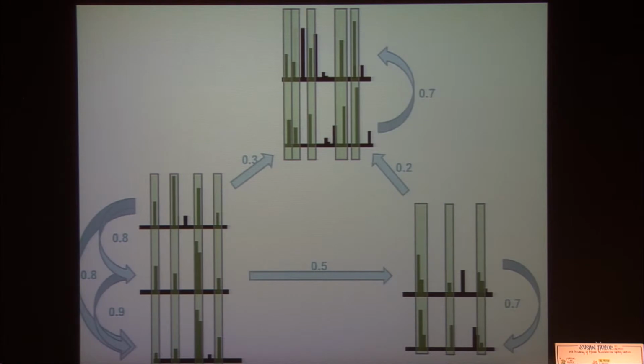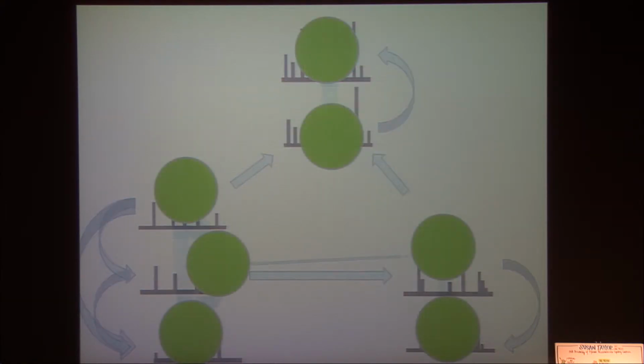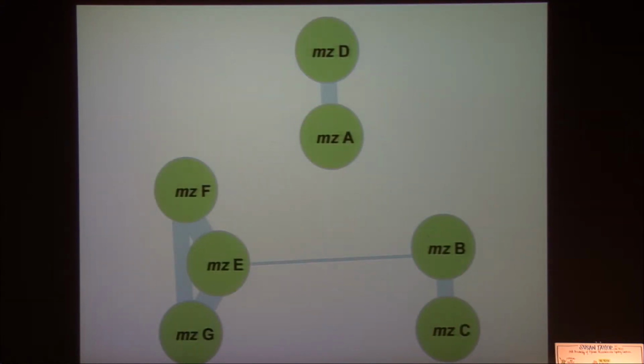And so first, what we need to do is find some sort of correlation score so that they really match up and align these different spectra. And of course, we can represent those as these little nodes. In this case, these nodes don't represent genes. No, they represent molecule classes. And so there's no biological function inherently embedded within these different correlations that we see.